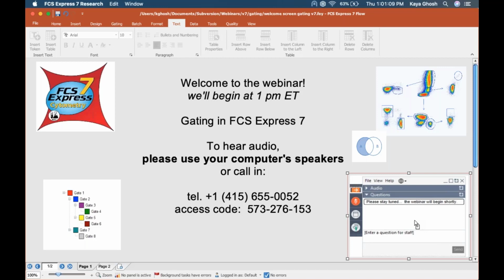Okay, so let's go ahead and get started. My name is Kaya Ghosh. I'm a technical applications specialist with FCS Express, and we're going to be talking about gating in FCS Express 7.